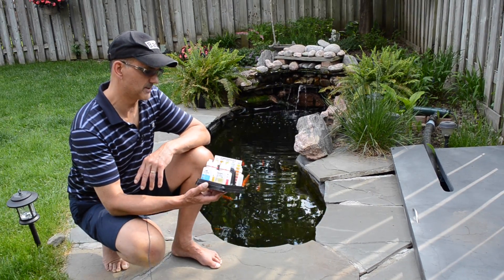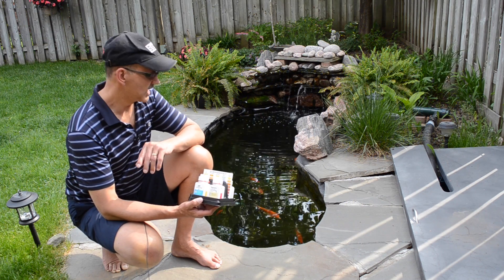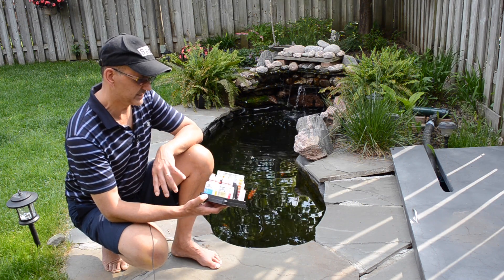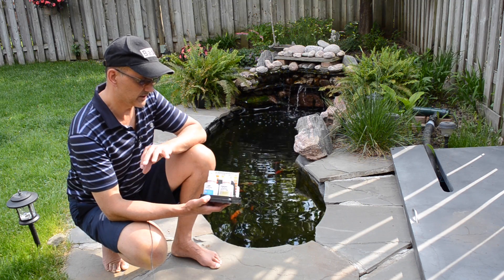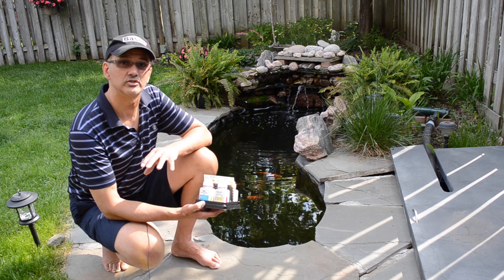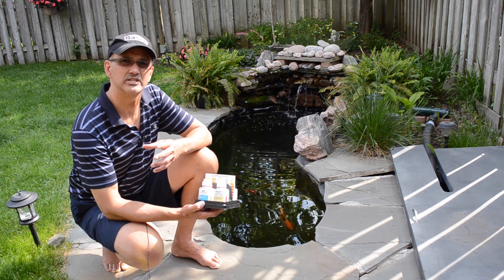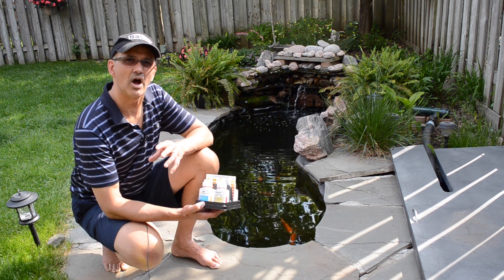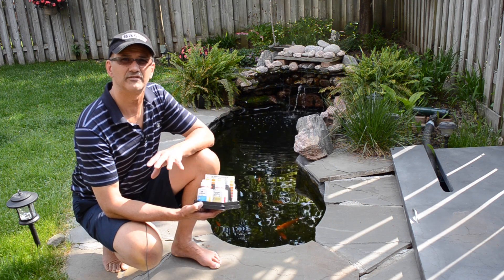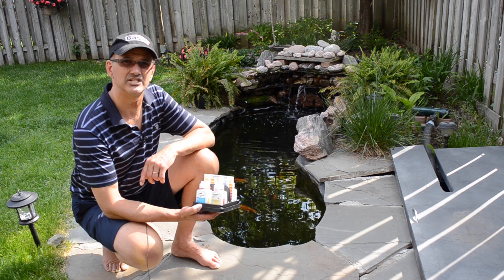Hi guys, today I want to talk to you about the importance of checking the water quality of your ponds. My pond is stocked with goldfish and koi, and today I'm going to check the pH level, the ammonia level, and the nitrite level. It's really important to check these levels every week or couple of weeks to make sure you're not running out of whack in the water quality for the safety of the fish. I'll go through those tests now and you'll see how easy it is.